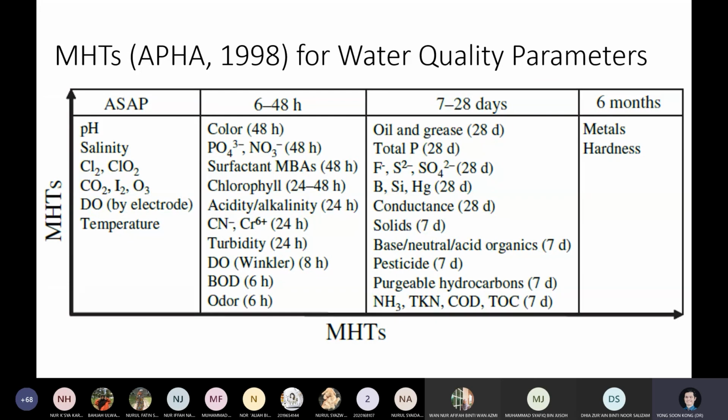It's a portable meter where you can measure pH, dissolved oxygen, salinity, electrical conductivity, total dissolved solids, and temperature. Those are the 6, but I was told that some of the advanced YSI can measure even more than that. So that depends on what electrode you're having.